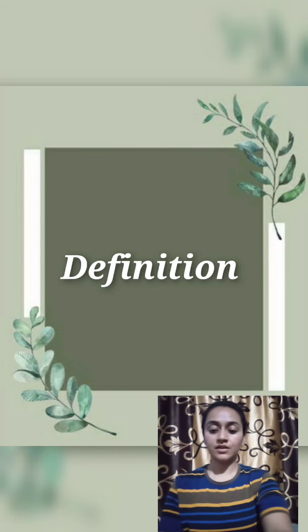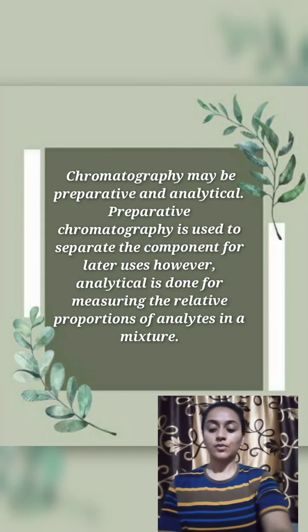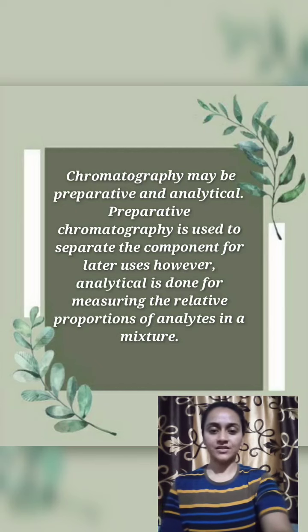Before we proceed further, we should know what chromatography is. Chromatography is a lab technique that allows the separation, purification, and identification of the constituents of a mixture for the purpose of qualitative and quantitative analysis. Chromatography may be preparative or analytical. Preparative chromatography is used to separate components for later use. However, analytical is done for measuring the relative proportions of analytes in a mixture.